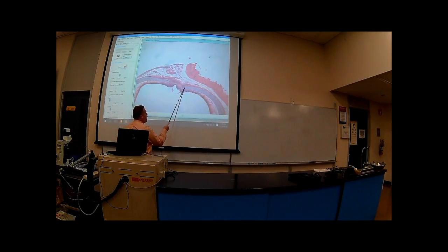I can even ask, if the hyaline cartilage ends here, and it also begins over here, making a gap here, then what organ would be located in this area over here? Yeah, the esophagus, right? We talked about how the esophagus is found posterior to the trachea. All right? This break over here allows the esophagus to bulge out as food goes through it, and it could press over here. This hard cartilage is not going to restrict the food from going down into the esophagus. The esophagus is allowed to expand because it's a C-shaped or U-shaped cartilage ring. Okay? So that's the trachea. Questions about that? Okay. All right, let's go to our next slide.